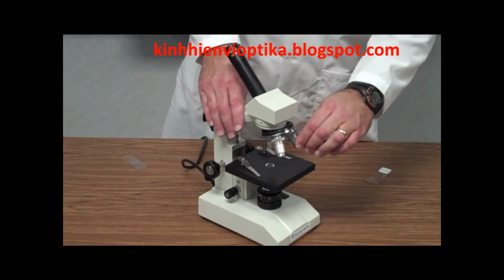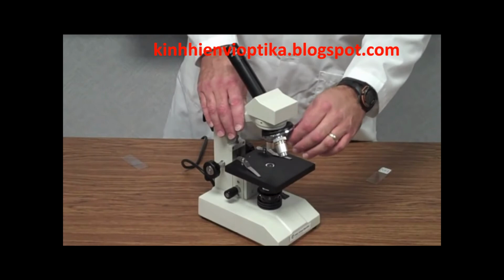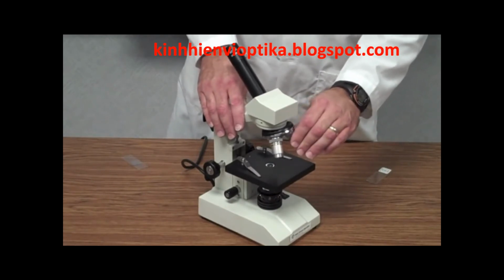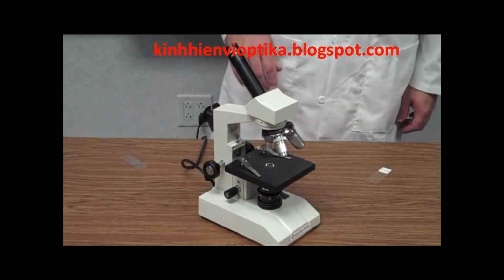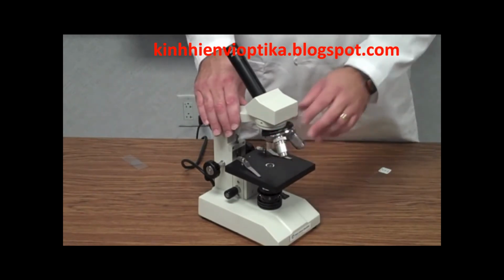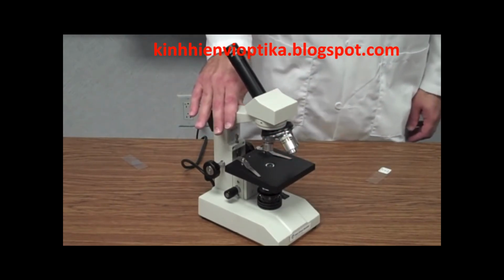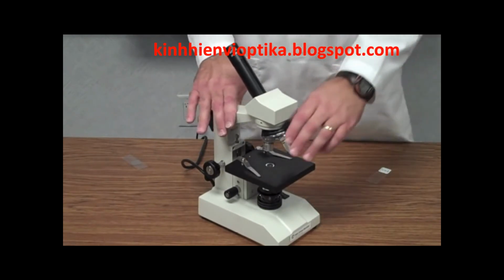Also, something I left out is whenever we're making sure that the objective is in place, make sure it clicks into place. Okay, there makes a little click noise. There's a definite locking sensation to it. Make sure it's locked into place. If you're not locked into place, if you're halfway between the medium and the low power objective, again, light cannot shine through. You're not going to be able to see anything.